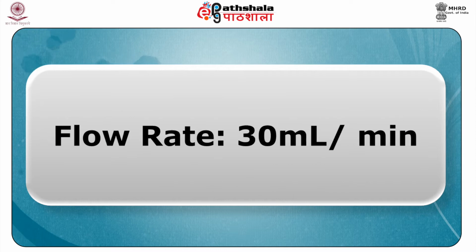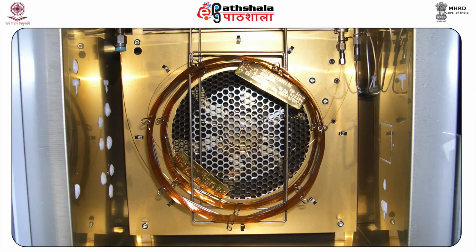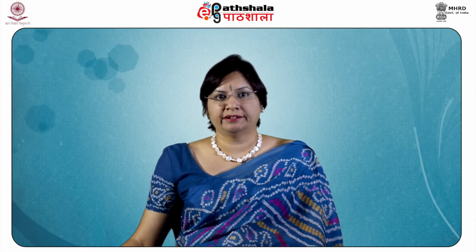The flow rate which is kept is 30 milliliters per minute, and the oven temperature is programmed, and this again varies for different materials that you are using. So, if it is for petrol or gasoline, it starts at 70 degrees centigrade, it is kept isothermal for 5 minutes and increases at 5 degrees per minute up to 120 degrees centigrade. So, the range is 70 to 120 degrees centigrade. Now, if the same process is being done for kerosene, then the temperature starts from 90 degrees centigrade and continues at 10 degrees centigrade per minute up to 220 degrees centigrade. The range is 90 to 220 degrees centigrade and the hold is for 5.5 minutes at 220 degrees centigrade.